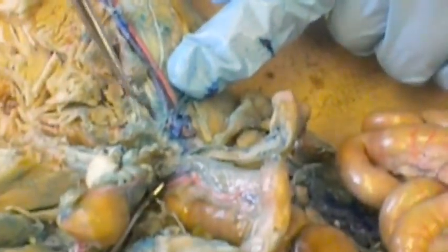So you just touch the red one there. Not that one, but flip that little piece back. Coming off right there. You guys are kind of handicapped because all that blue latex was in there. But if you know where they come off, yep, so that's coming off right there. So that'd be the deep femoral? Yep. And then after that it'd be all femoral?